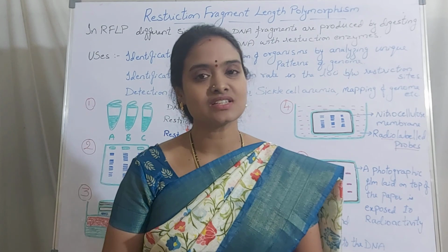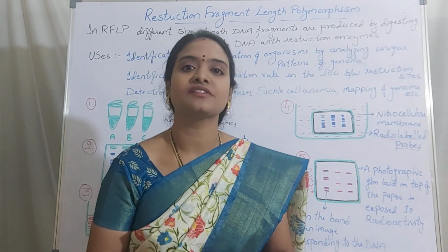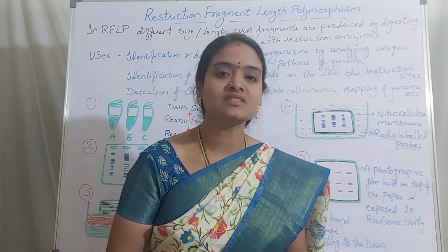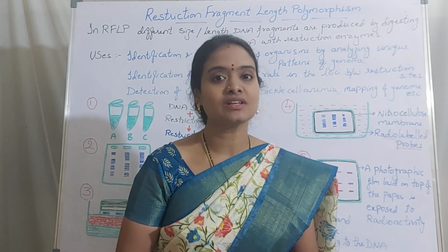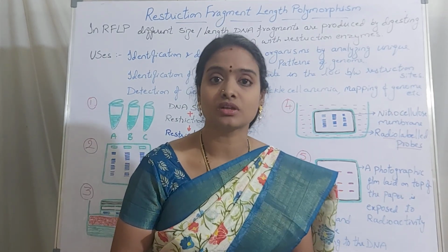So in today's class we will discuss about RFLP. RFLP is nothing but restriction fragment length polymorphism. So in last class we have discussed about molecular markers.